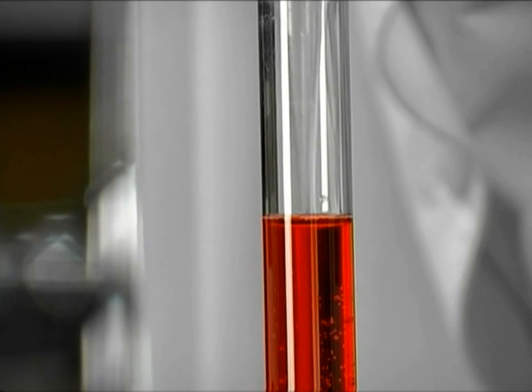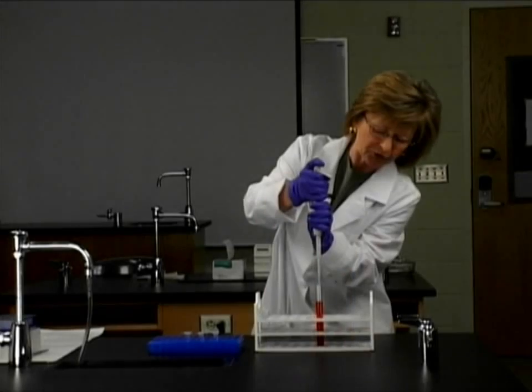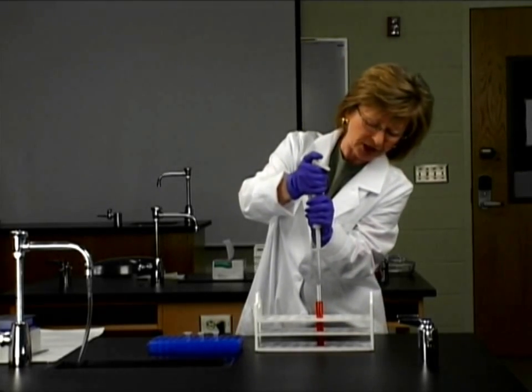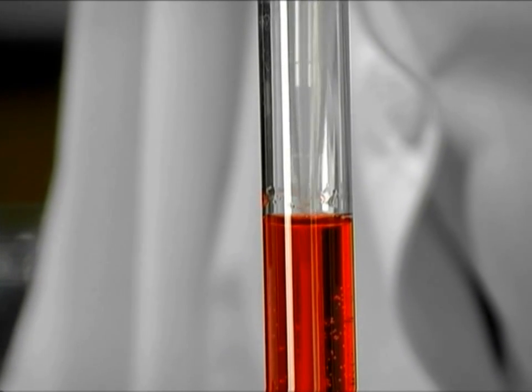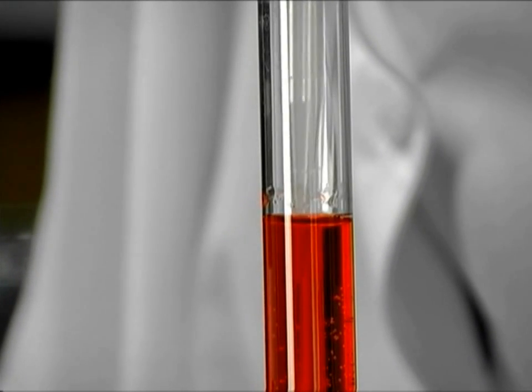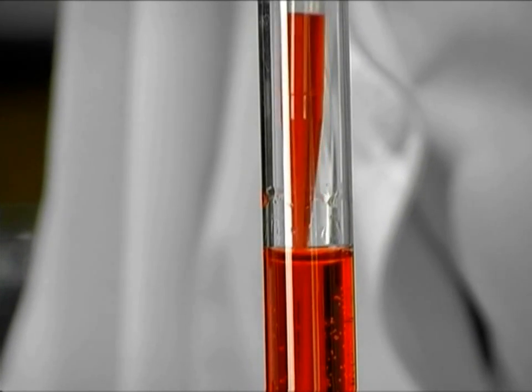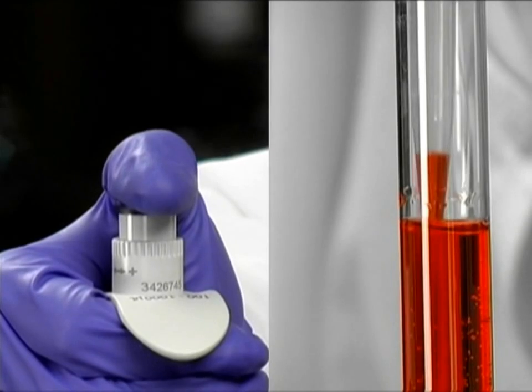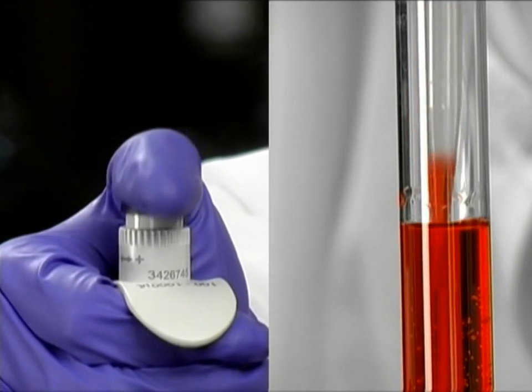If we don't expel the air first, we're going to get a whole bunch of bubbling, which will really interfere with our ability to make a precise measurement. So we're going to expel the air first, push down to the first stop, go down just below the meniscus into the center. We're going to pre-wet the tip slowly a few times, up and down, so that our measurement is going to be accurate.